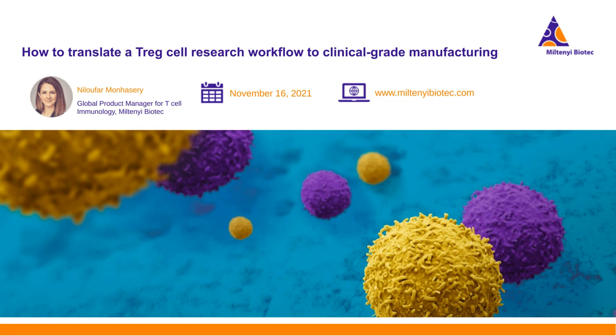All right, so our first question is, what do you mean about translating from research to clinical? Are the products the same? It's a really good question. I receive this question very often. Our products are not really identical. They are similar, but the main point is that we need to set up our experiment on a smaller scale and get some optimization and some results, which is the basis of your next action, which might be translated to your clinical work.